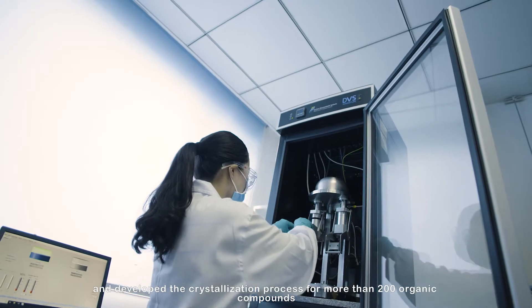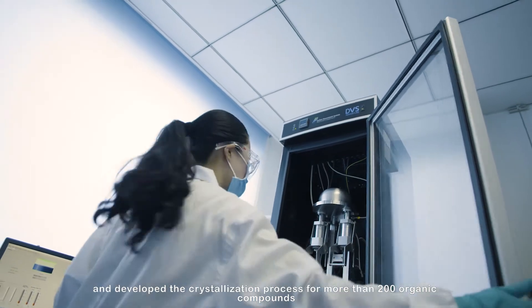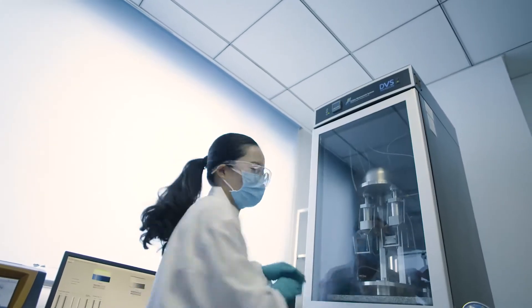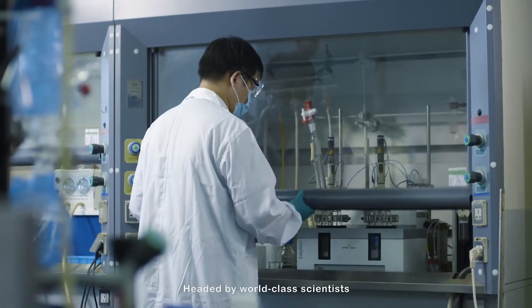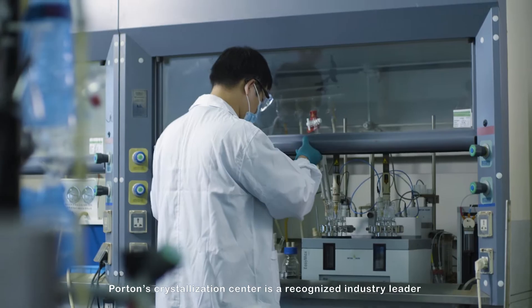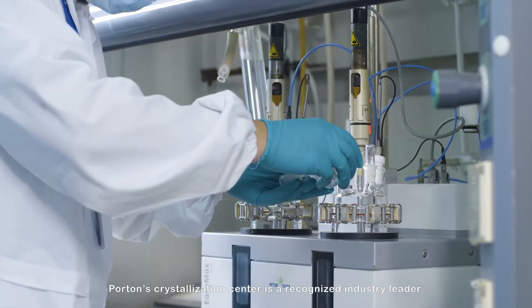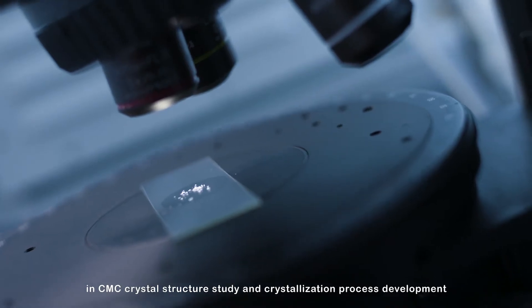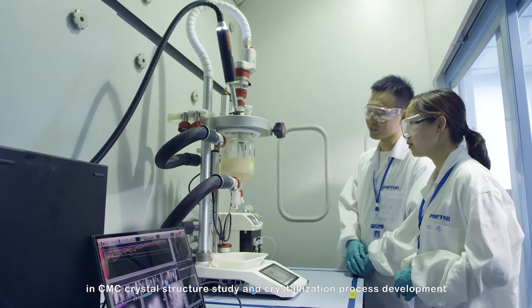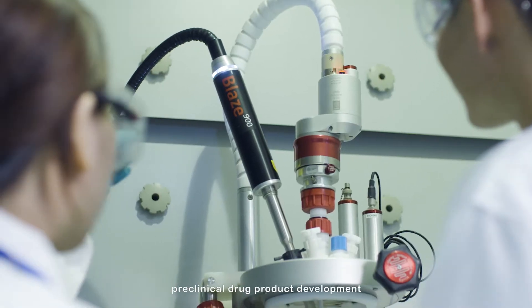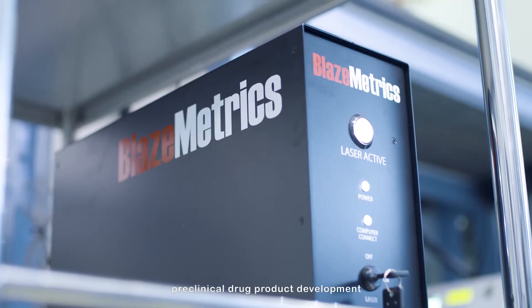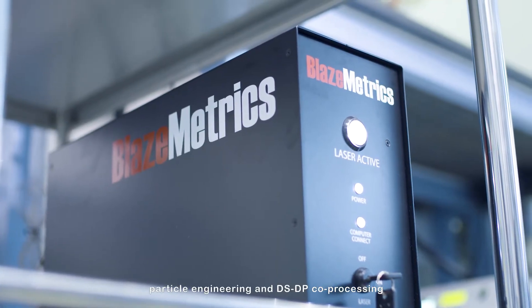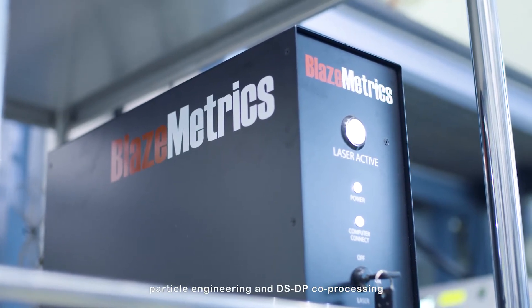and developed the crystallization process for more than 200 organic compounds. Headed by world class scientists, Porton's crystallization center is a recognized industry leader in CMC crystal structure study and crystallization process development, preclinical drug product development, particle engineering and DSDP co-processing.